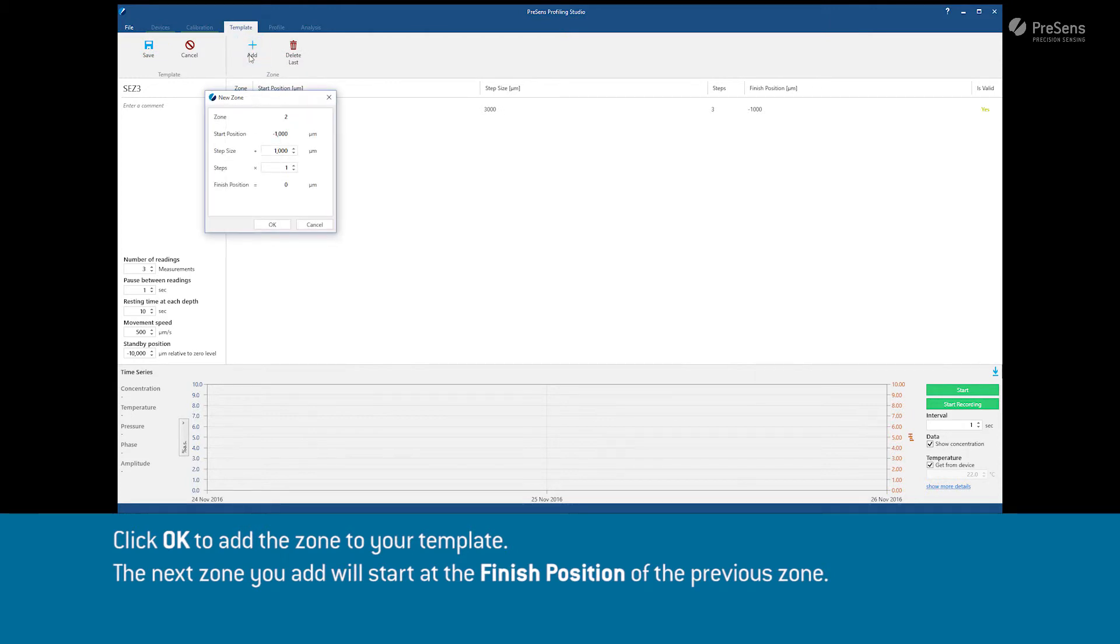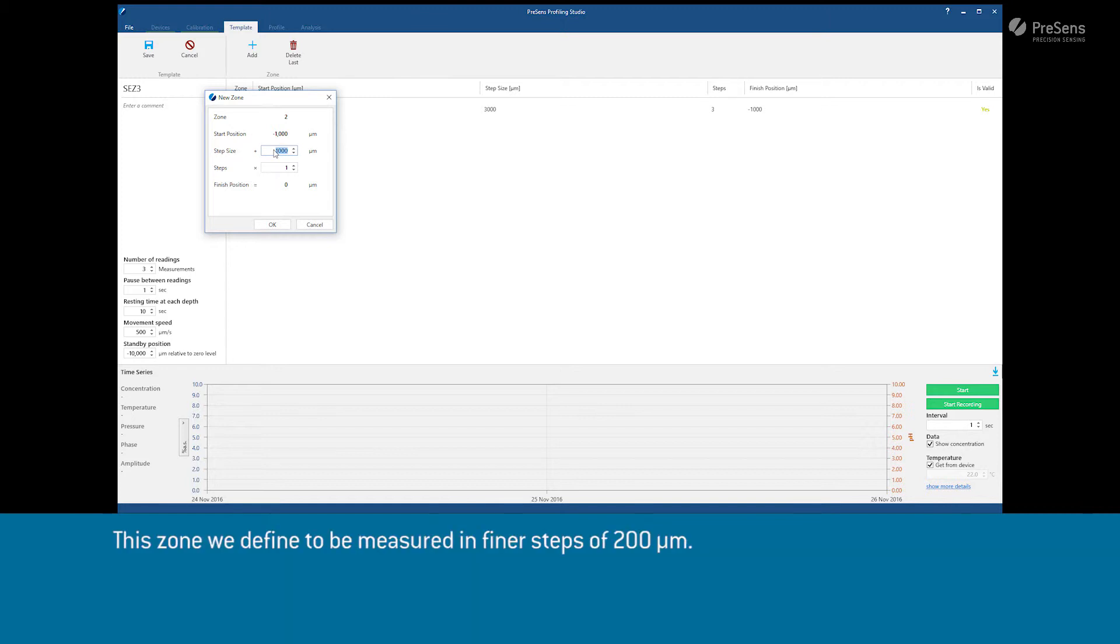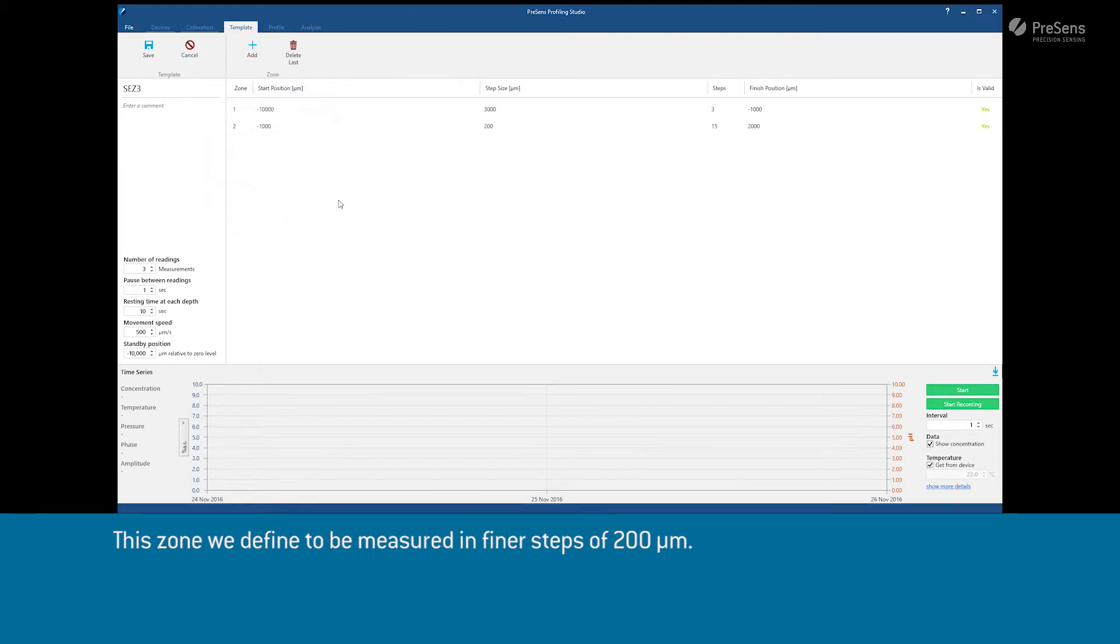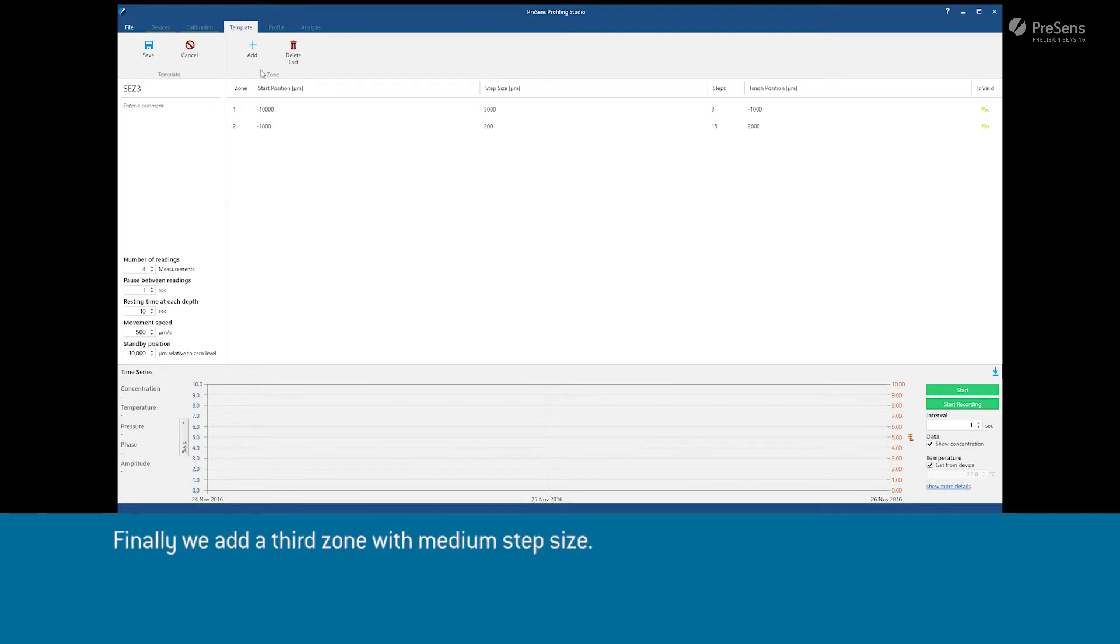The next zone you add will start at the finish position of the previous zone. This zone we define to be measured in fine steps of 200 micrometers. Finally we add a third zone with medium step size.